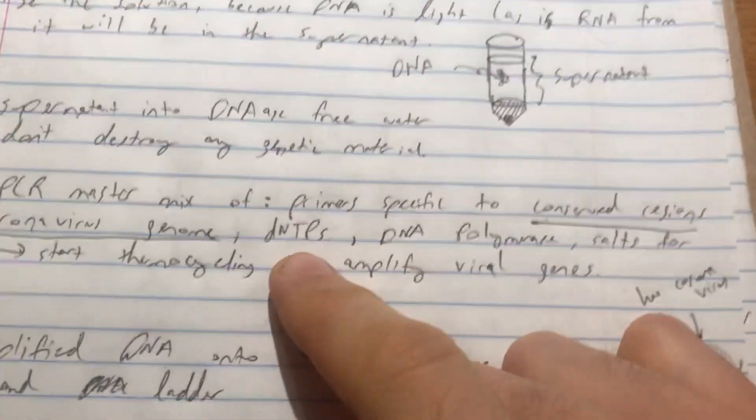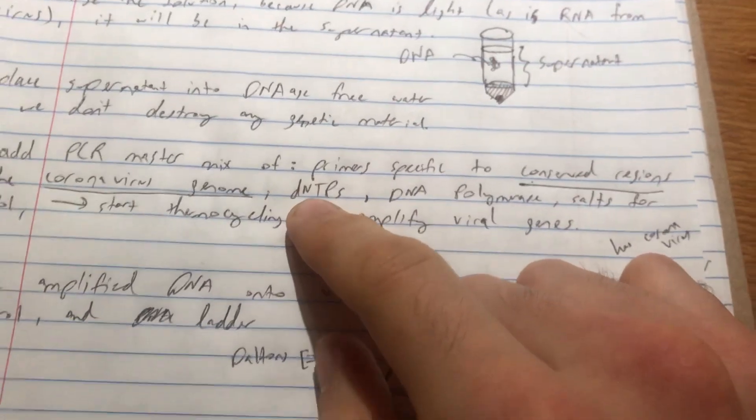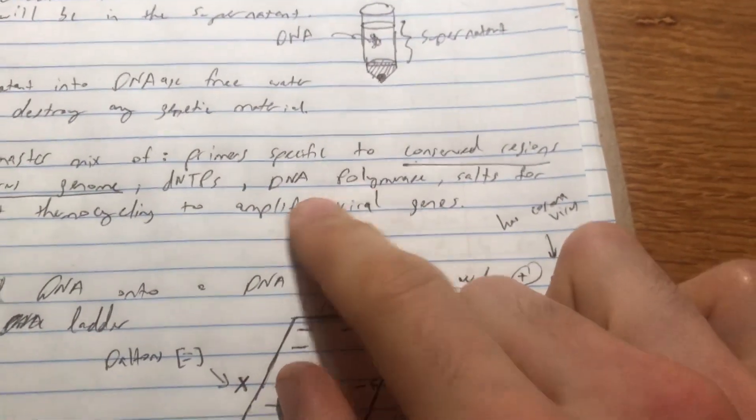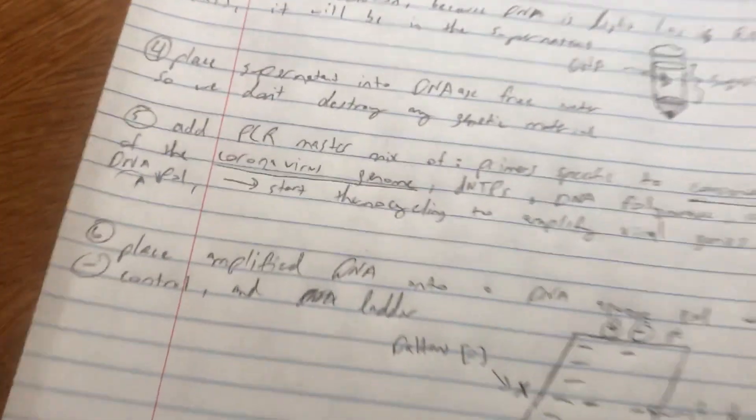So we're going to provide dNTPs, these are the ATGC. So we need to provide these and we also provide DNA polymerase that can withstand high temperatures up to 95 degrees Celsius, as well as salts to help stabilize and activate the DNA polymerase.